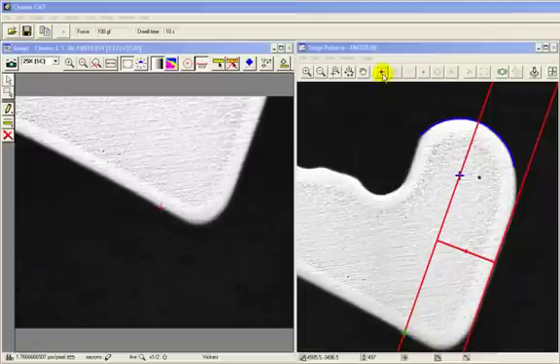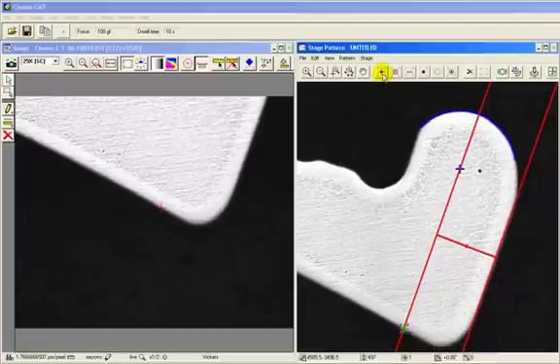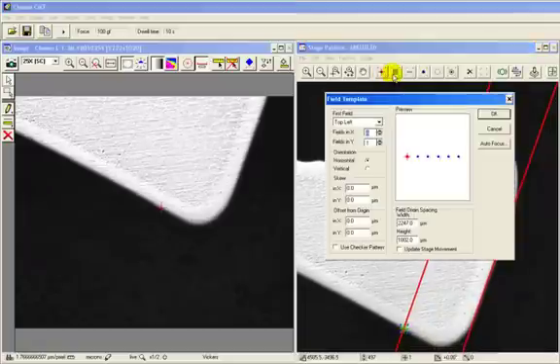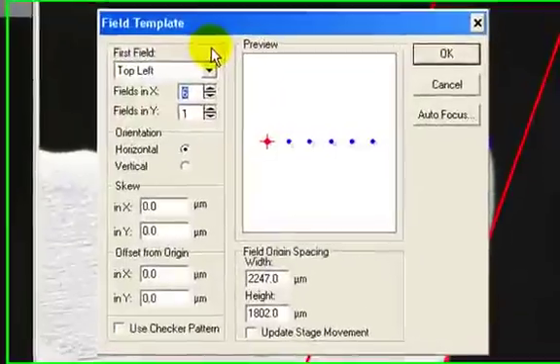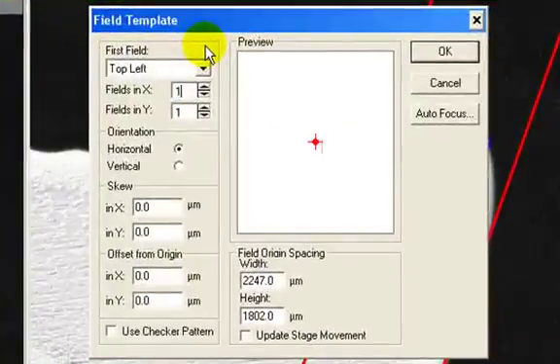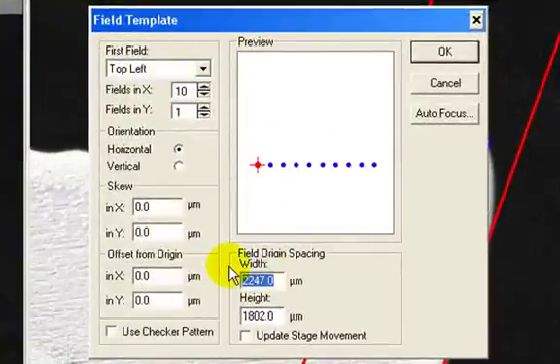Having reached the desired starting point, we can now set up our indent pattern, adjusting the number of indents, the spacing, and distance from the edge.